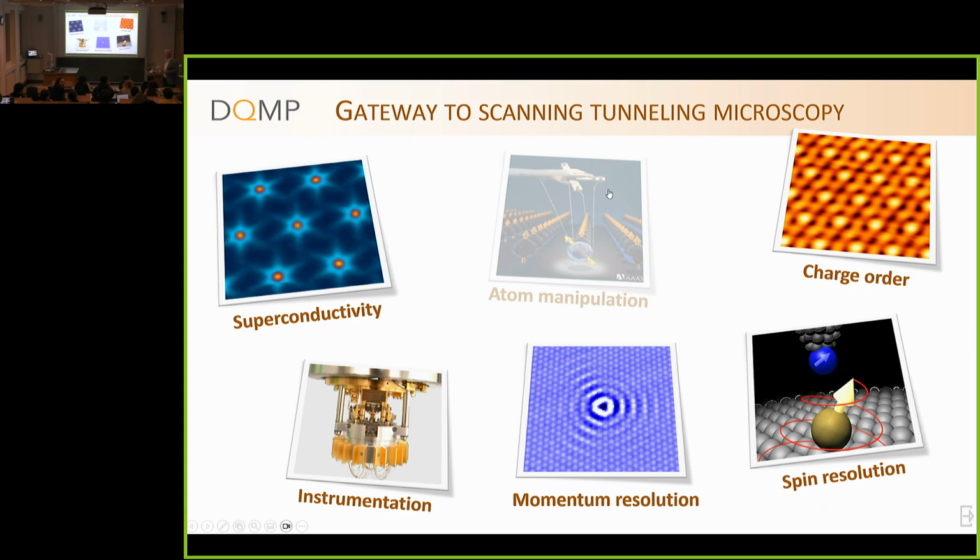I'm trying to imagine which could be the mechanics that allows you the precision of a nanometer in positioning and the scanning moving from one atom to another. Probably you do this many times, but how does it work from the instrument? These are piezoelectrics that move, and then you have a reference image with a defect somewhere, and there are protocols where you image this defect and then correct for drift, and then you go back to the region not too far away, because piezos also have a hysteresis. And if you come from a different history, you will not end up in the same place.